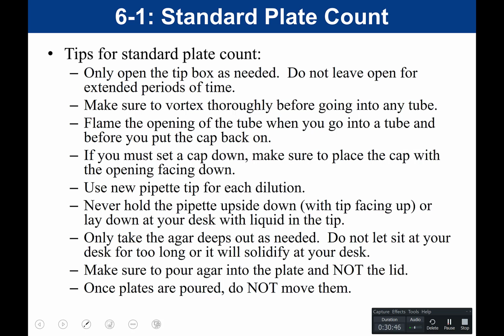You always want to make sure to vortex thoroughly before going into any tube. So anytime you're going to transfer liquid from one tube to another, you need to mix well in order to transfer to the next tube. Just like in our aseptic technique, you need to make sure to flame the opening of the tube when you go into the tube and before you put the cap back on, right?